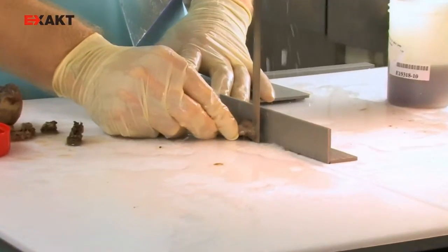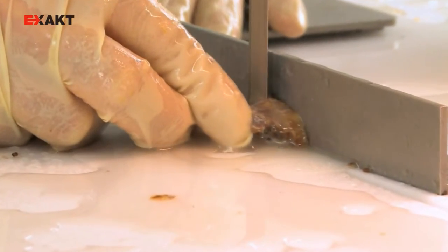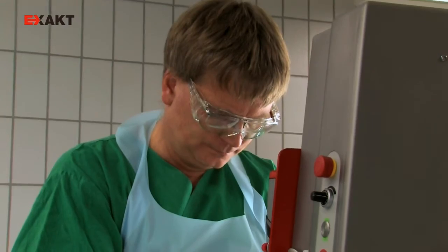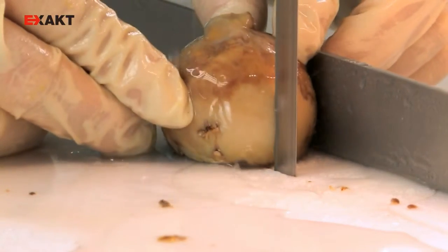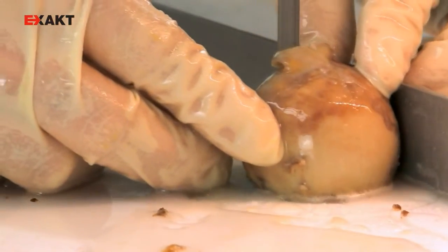Here you can see an incision that allows you to present information such as resection margins very precisely — like in this case of a femoral neck fracture. The stop can be adjusted using a ruler with millimeter accuracy, allowing the specimens to be brought to the desired height immediately.